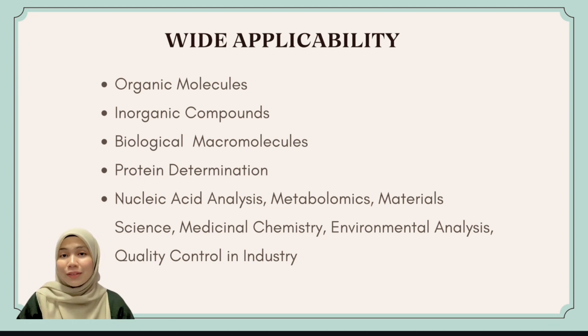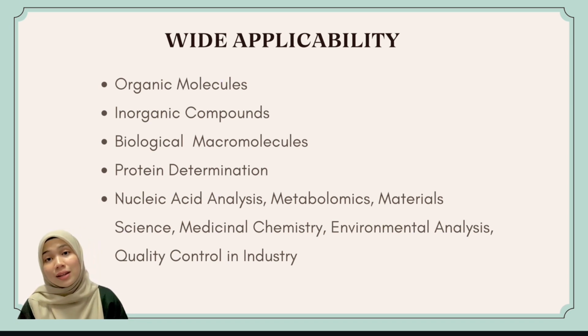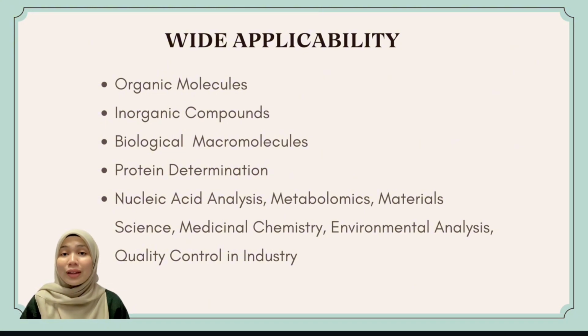NMR also plays a vital role in nucleic acid analysis, metabolomics, material science, medicinal chemistry, environmental analysis, and quality control in industries such as pharmaceuticals and food, to ensure the integrity and purity of chemical products across various applications.